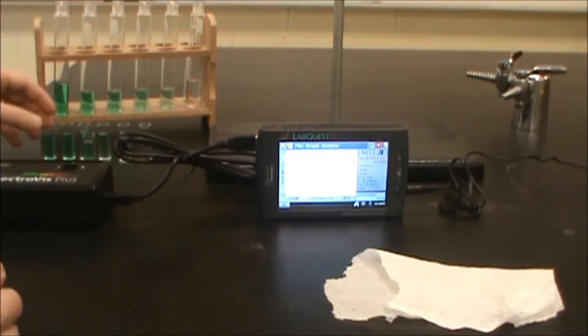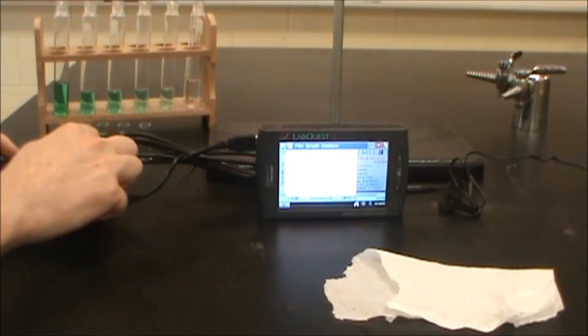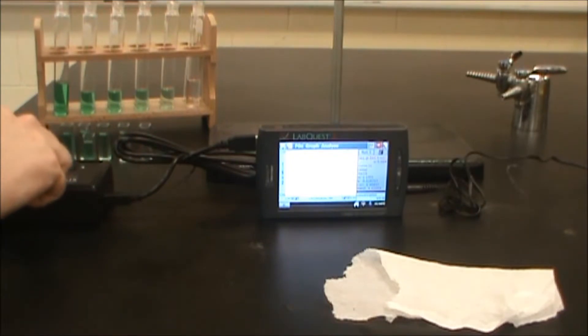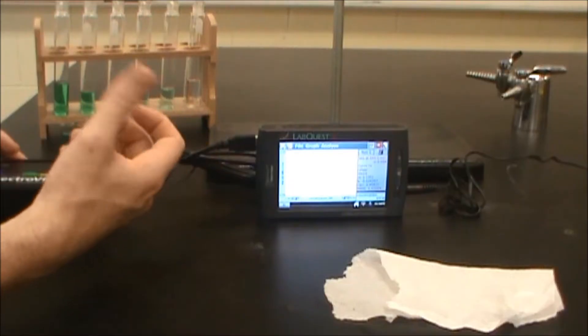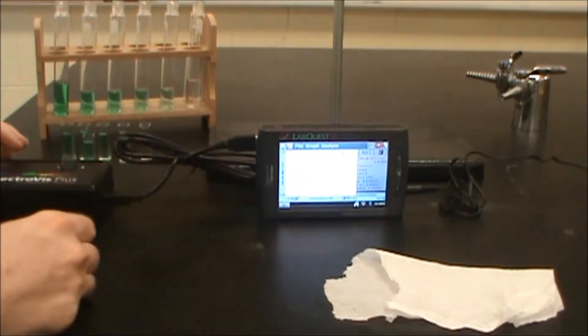And what I'm going to do is I'm going to put them into the SpectraVis Plus, which shines a light from this side to a detector over here. And the light that makes it through gets detected, and that amount of current will tell you how much light is being absorbed and how much is being transmitted, which then can be displayed on this screen here.